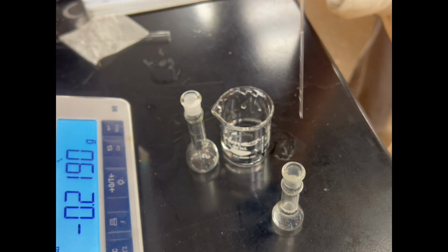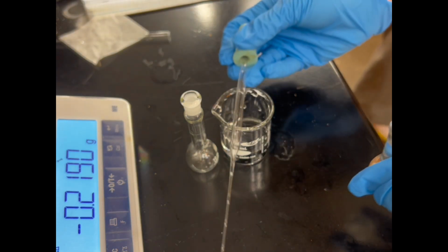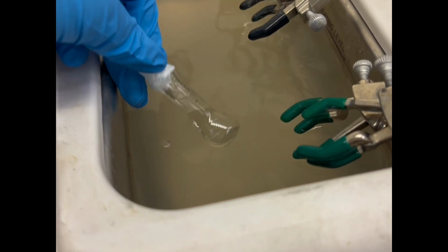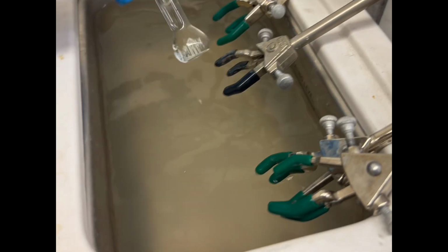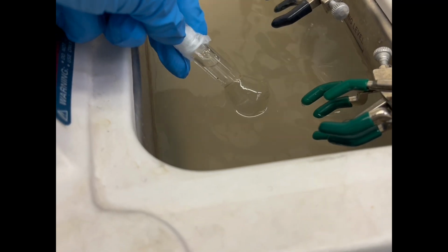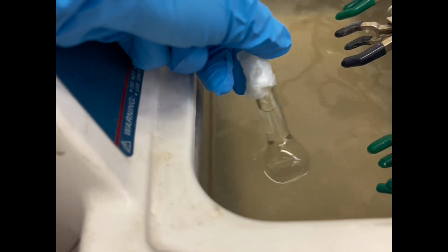And then we'll fill it up to the line. Because we're making 5 ml, so that is not a very big volume, make sure while we're rinsing it, we do not miss the line, like fill it higher than the line. Then we sonicate it quickly to make sure all the solid is fully dissolved in our solvent.